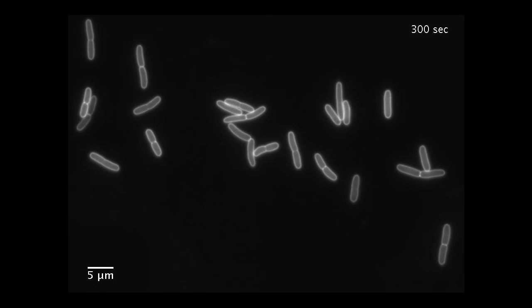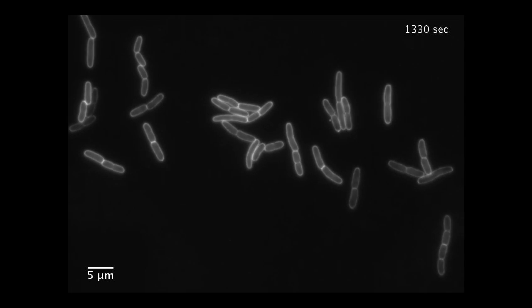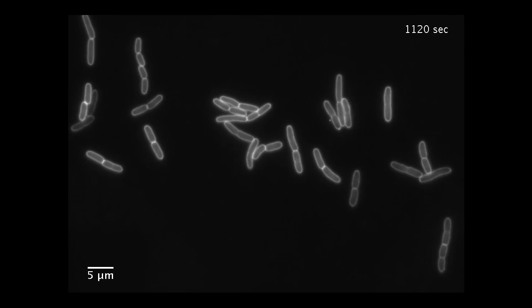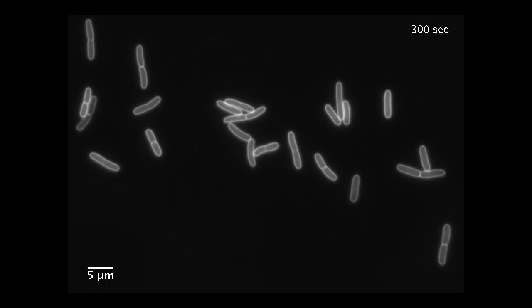In the movie that you're seeing now, these are a number of E. coli cells, and like I said, their cell wall has been stained with a fluorescent label. As you can see, they're growing, but they are also swelling and shrinking as they're growing. That is because the osmotic pressure within the cells is being toggled up and down as I change the osmolarity of their growth medium from one that's high to one that's low, and back and forth.